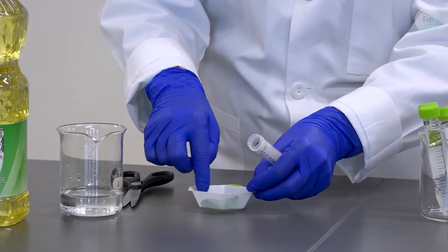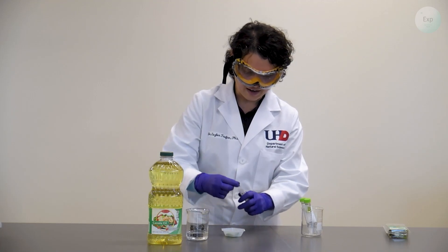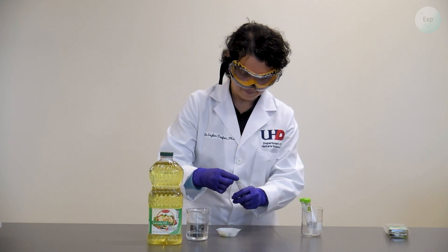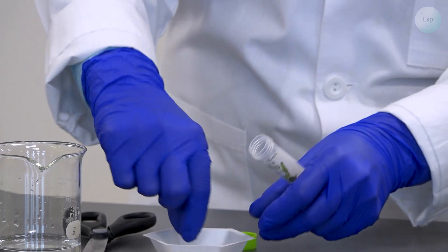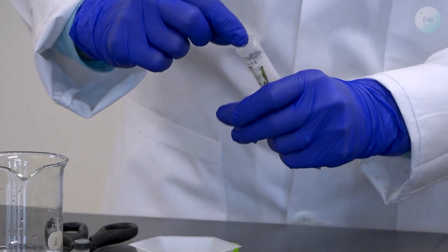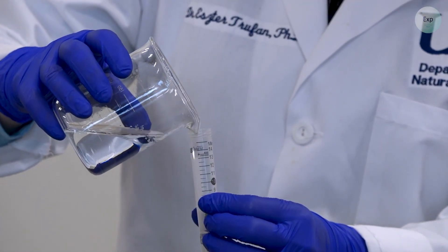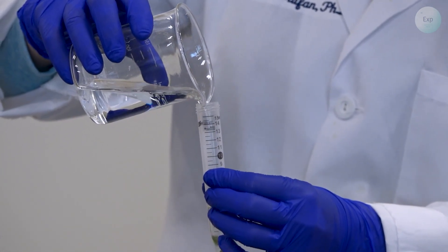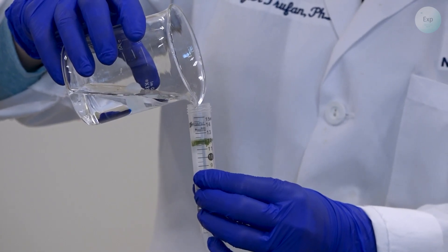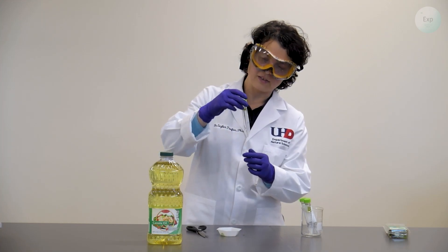Once I have it in small enough pieces I'm going to transfer those little pieces into the screw-cap vial and add the same amount of water to it. Just like before, I will try to keep the mint leaves under the water level.